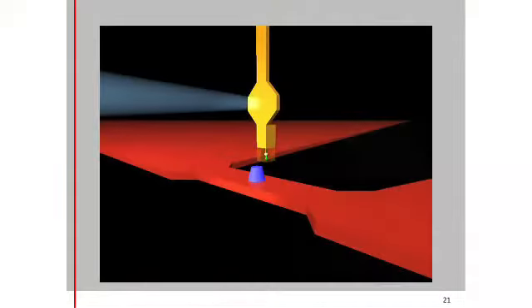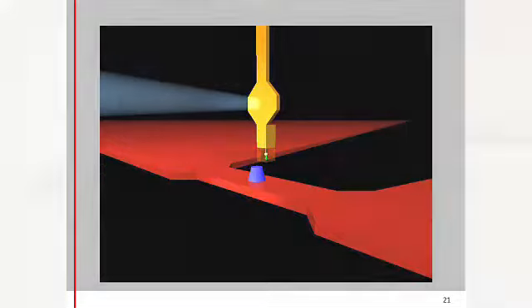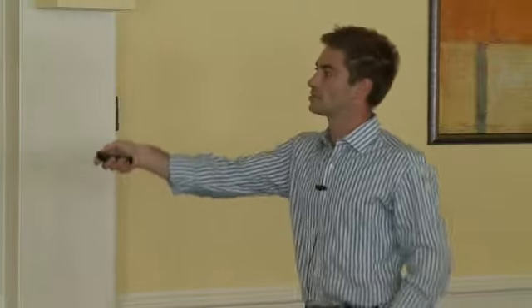But what I neglected to tell you is that we can take advantage of the magic of magnetic resonance to bring these kinds of forces out of the background noise. So this red blob that I'm showing you is actually what we call a microwire, essentially an RF short. We pass some RF currents through here, and that creates some perpendicular time-varying magnetic fields in this direction. And using this RF short and sending some pulse sequences through here, we can essentially flip these nuclear spins at more or less any frequency we like.